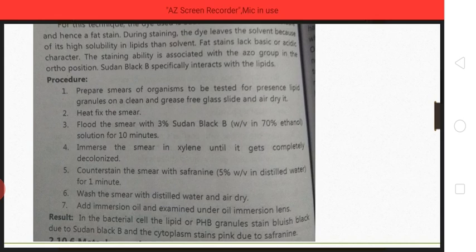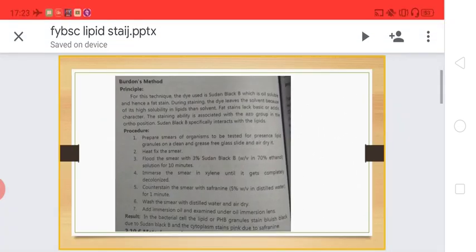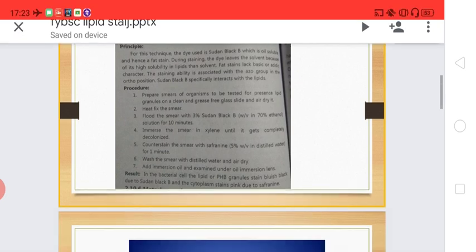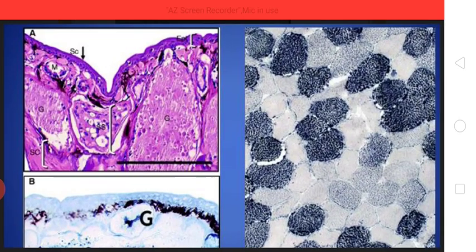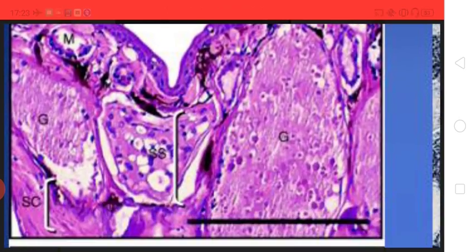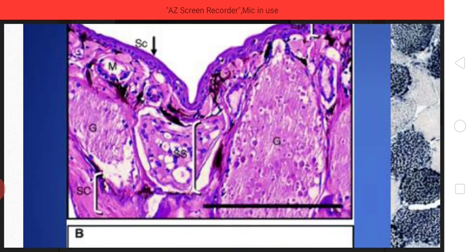Under the microscope, the lipid granules or PHB granules will appear bluish-black, stained by Sudan Black B, while the cytoplasm will appear pink due to safranine. Here we can see the lipid granules in bluish-black color and the cytoplasm looking pink in color.